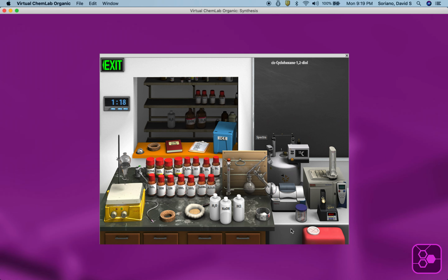So that is a demonstration of the reaction. The product can be seen up here. If you hold the L button, it's the 1,2-cis. Once again, because as I said, syn addition, and that would then give you only the cis diastereomer, not the trans.